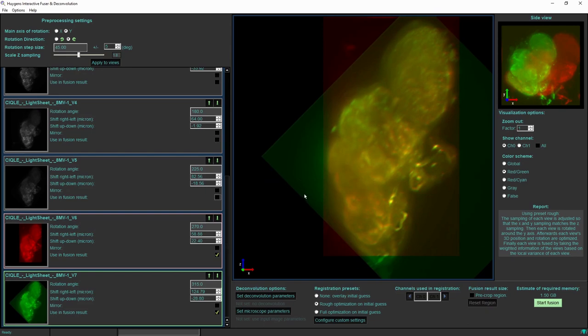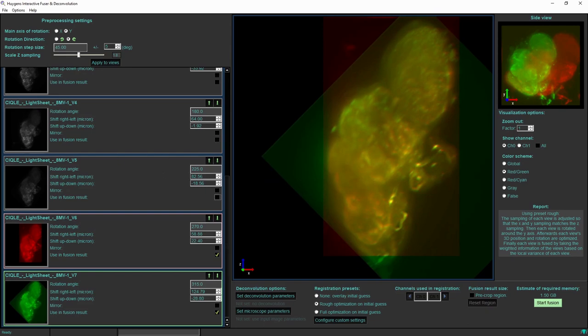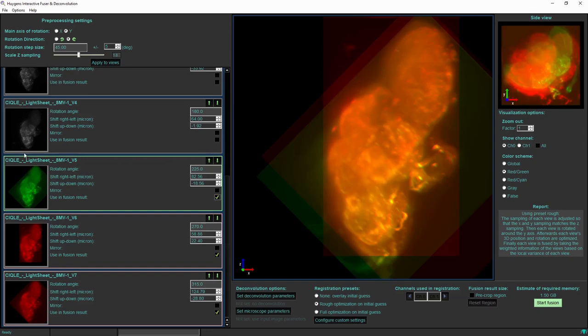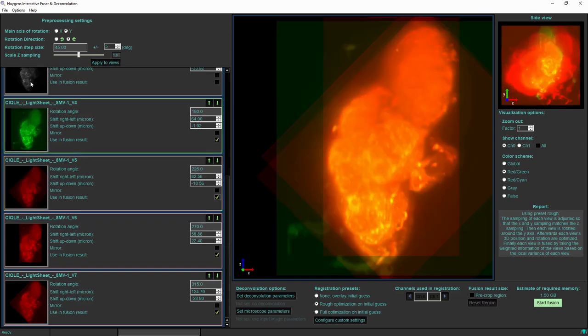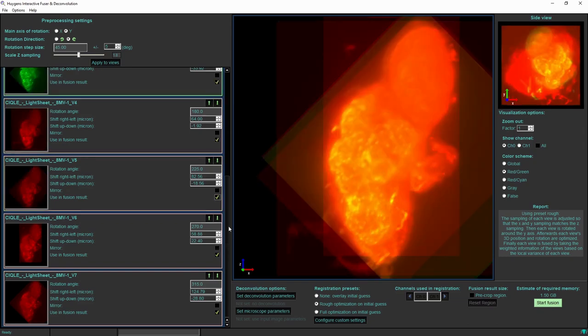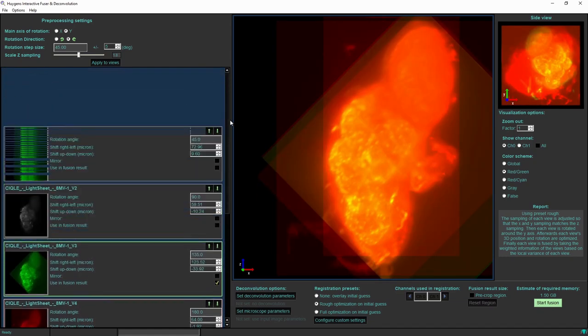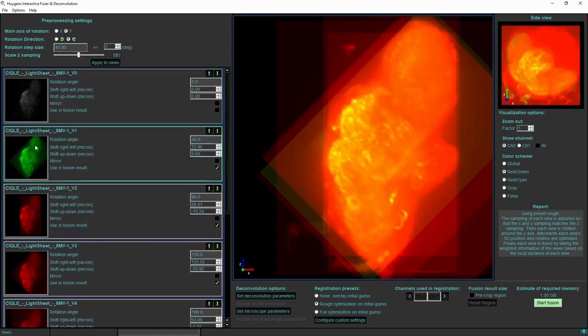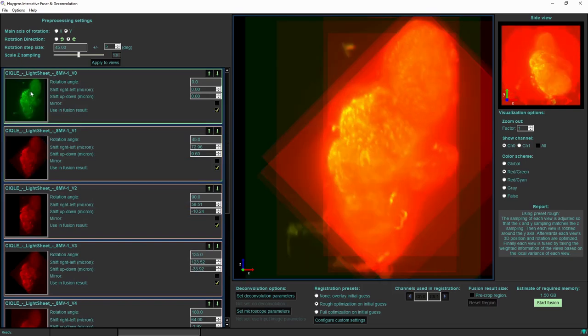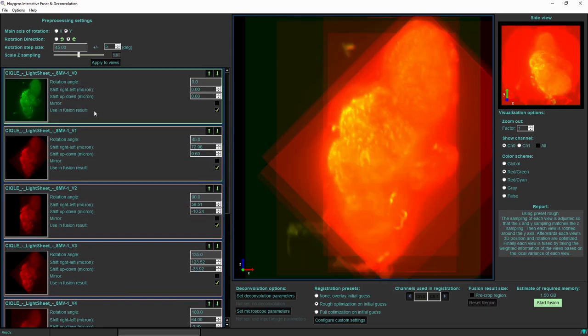Now if I am completely through the list I should select all of the input views if I want to combine all eight of them, because now I am selecting the checkbox use them in the fusion result.